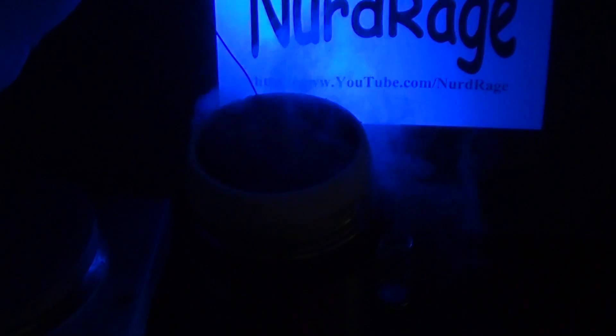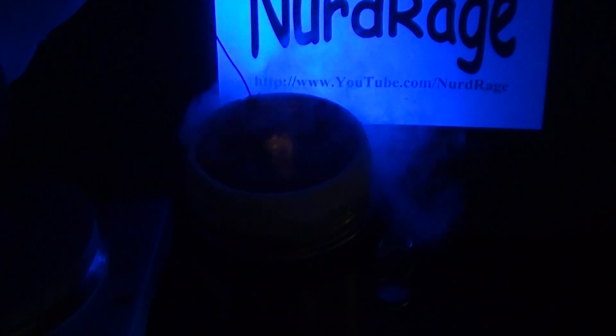I've lowered in the sample and as it freezes the sample will start to fluoresce. The exact reason why this happens is somewhat complicated to explain.